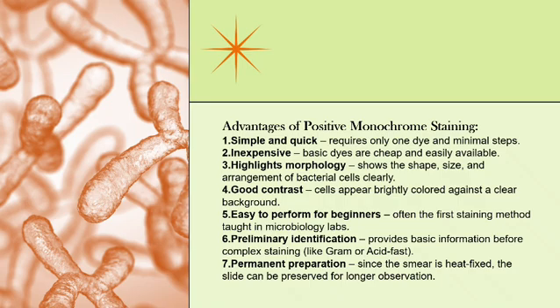Easy to perform for beginners. Often the first staining method taught in a microbiology lab. Preliminary identification provides basic information before complex staining. Permanent preparation. Since the smear is heat fixed, the slide can be preserved for longer observation.